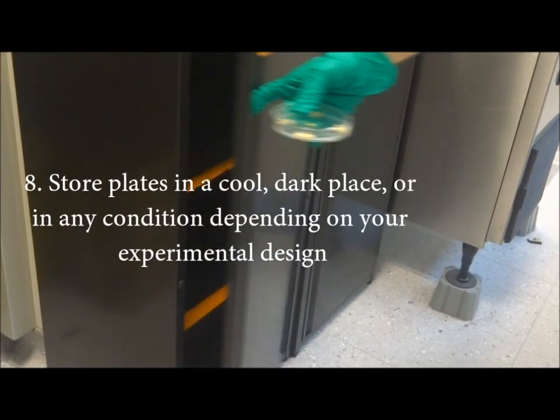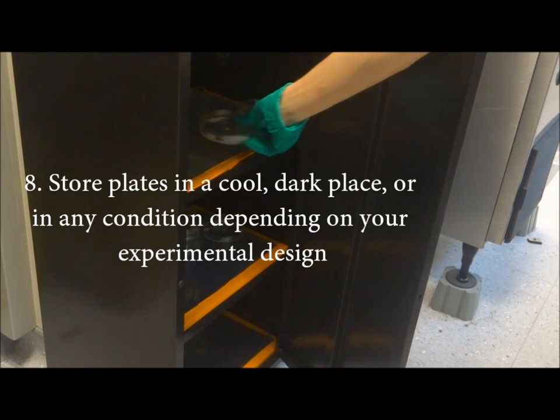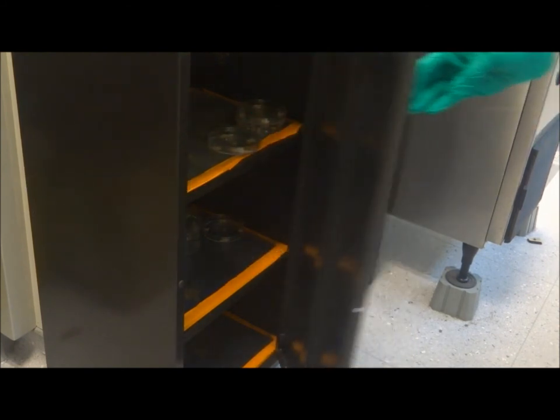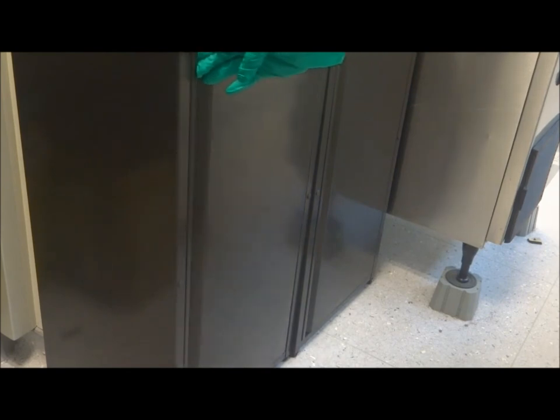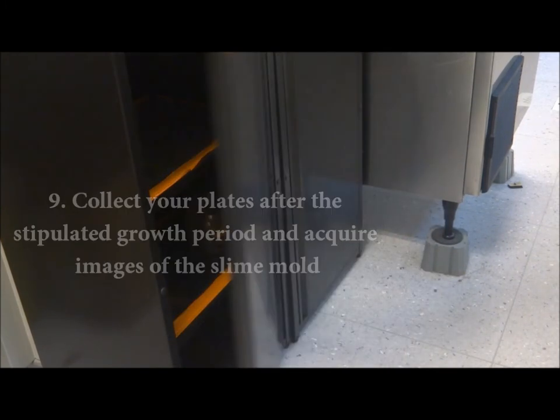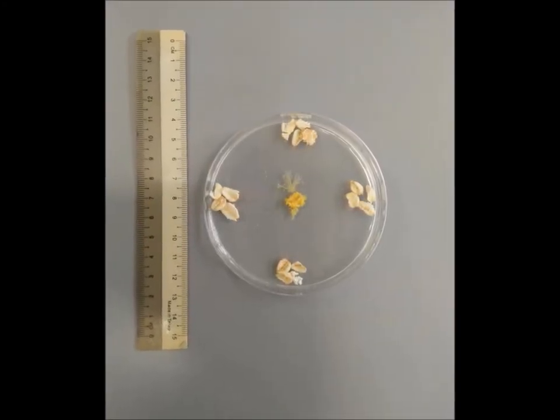Store the slime mould in a cool dark place. You may alter certain storage conditions such as light exposure, temperature or humidity depending on your experimental design. Collect the plates after the required growth period. Acquire images of your slime mould using your phone or a camera. Remember to take pictures of your slime mould with a ruler so that you know the scale of your image.